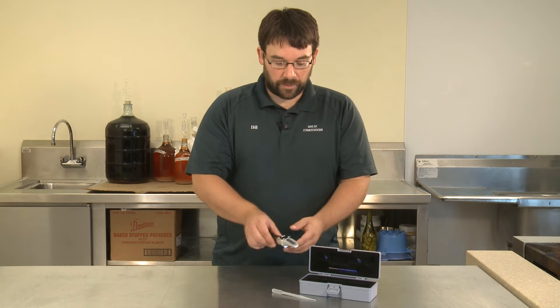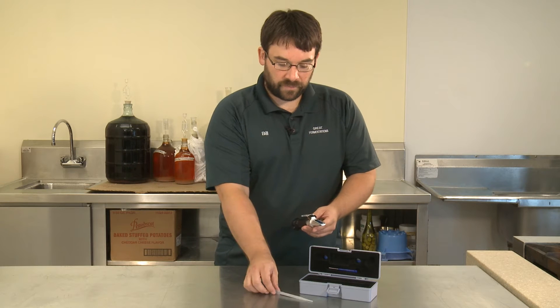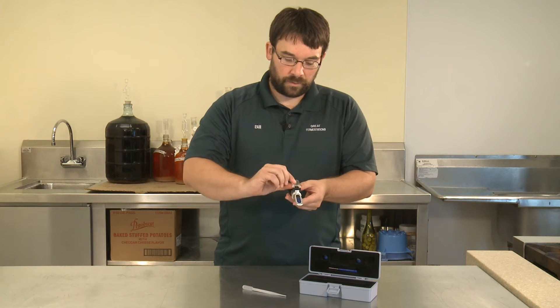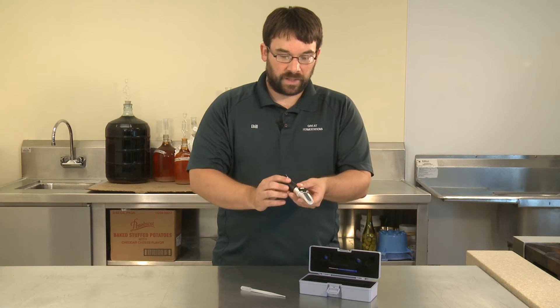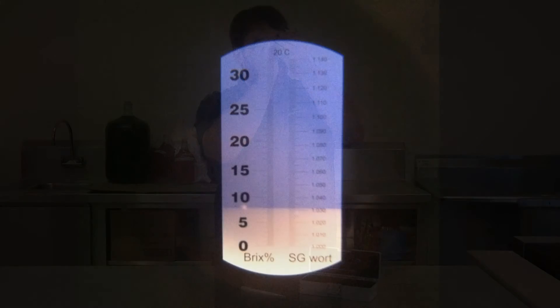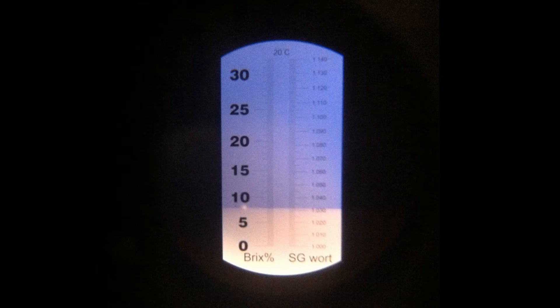Now in order to use a refractometer, you would take your pipette, drop a little bit of liquid onto the window, close the protector, and look through the refractometer toward a light source. You'll see a dividing line between the blue area and the white area indicating your sugar level.